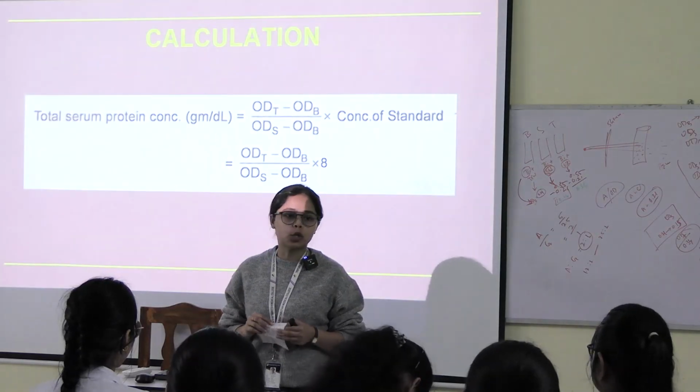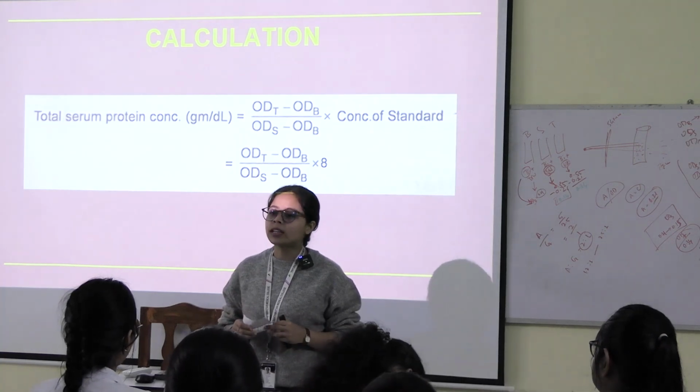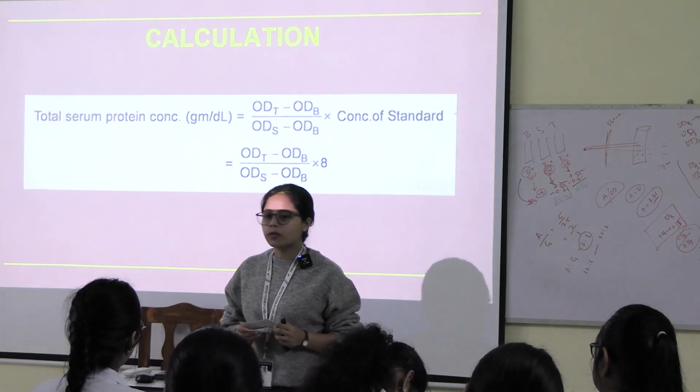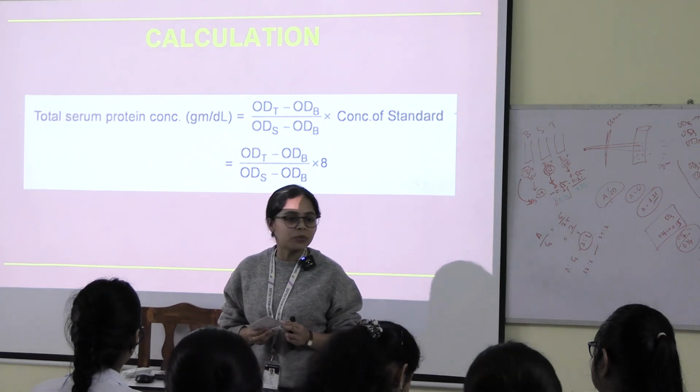So it's same. I was saying that when you give your blood test in 2 different labs, do you get the same result? You won't. You will get a 0.5, 0.2 difference. And that varies because of the kit. Kit to kit gives you different results. But the difference is not much. Not more than 10%.